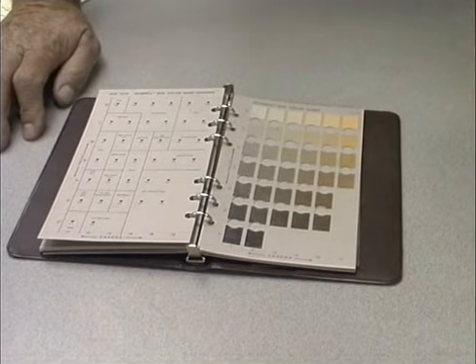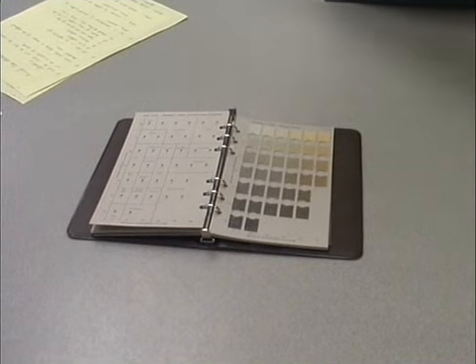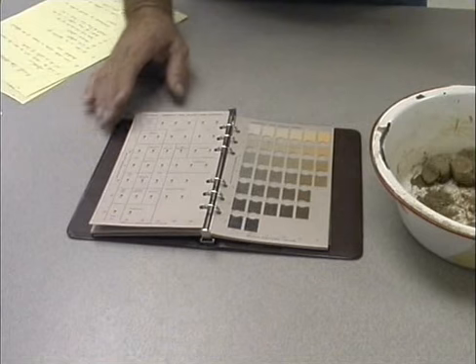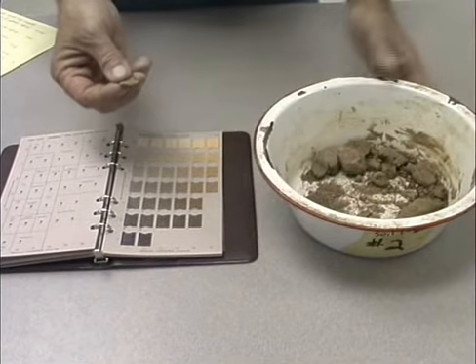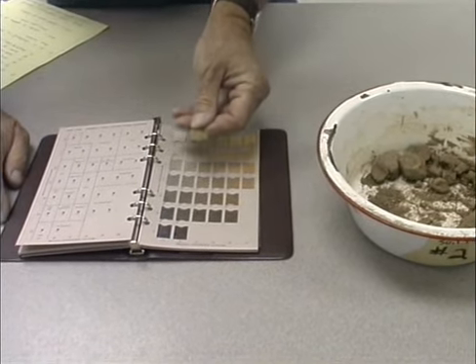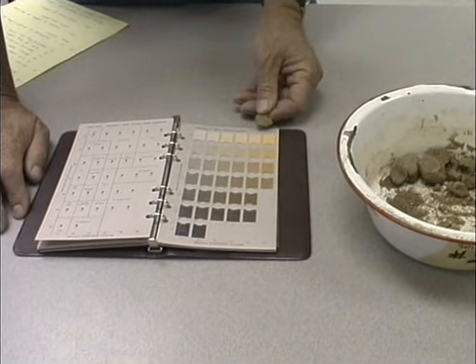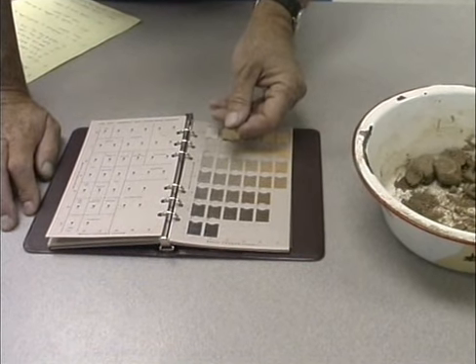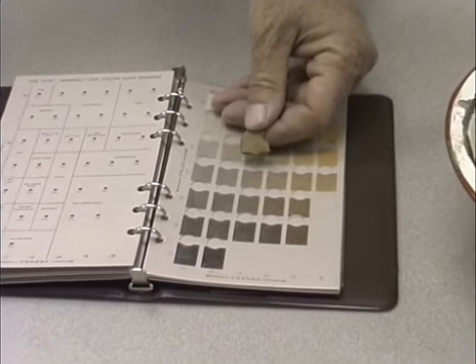Now, if I look at sample number 2, upon initial observation, sample number 2 appears to be much lighter in color than sample number 1. Yet it still has a hue that's going to fall within this page of 10YR. I'm probably going to be further up the chart, meaning that I have not quite as dark a soil, but I have a lighter soil.